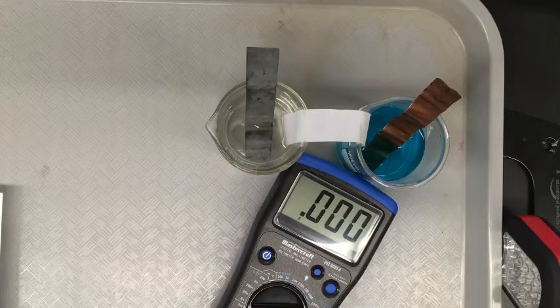In this video, we're going to investigate the factors that affect the voltage made by a voltaic cell. So the first thing we're going to do is set up a voltaic cell. And remember from our lessons, they're electrochemical cells that use a spontaneous chemical reaction to produce a voltage. So we can make those by having two half cells separated by a salt bridge.